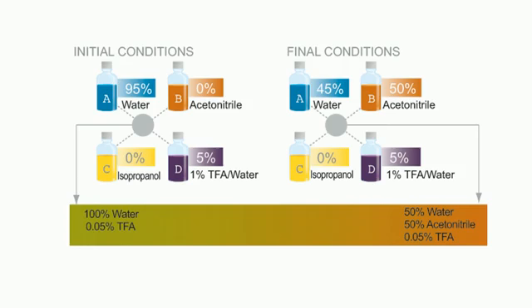If you look at this diagram of how the auto blend method works, you can see how we run a gradient of increasing acetonitrile in the presence of TFA, using, as I said, bottles of pure solvent and modifier. We can change the concentration of TFA if we need to, simply by programming a different percentage from the D line. This is important for methods development because a reverse phase separation is dependent upon the organic solvent, the identity of the modifier, the pH, and the ionic strength.